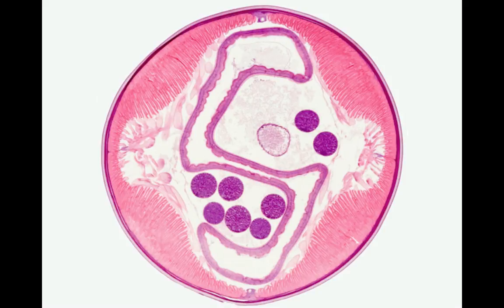Here we have a cross-section of a male Ascaris, greatly magnified, of course. We are going to identify the main structures. First, there is the cuticle, which is the outermost layer of the specimen. It is a proteinaceous structure, which is secreted by the next layer, the epidermis.